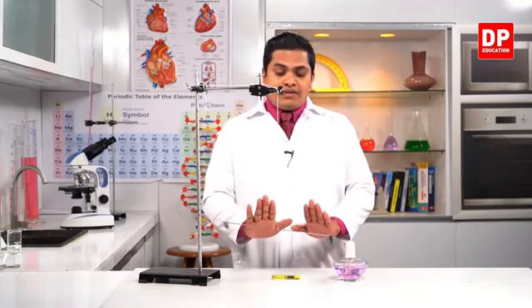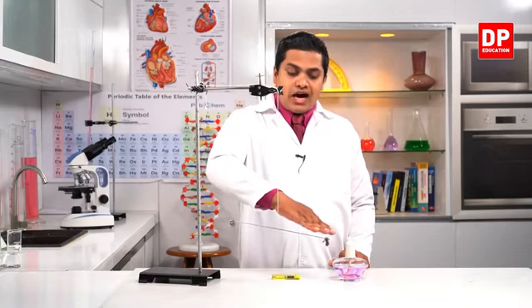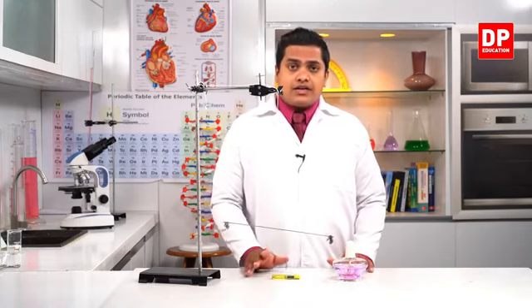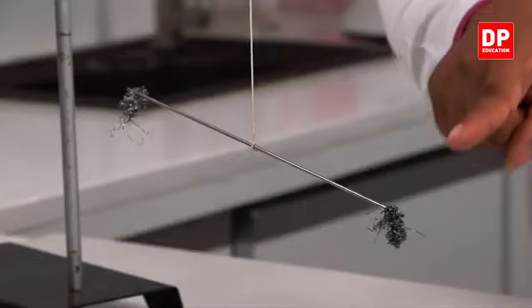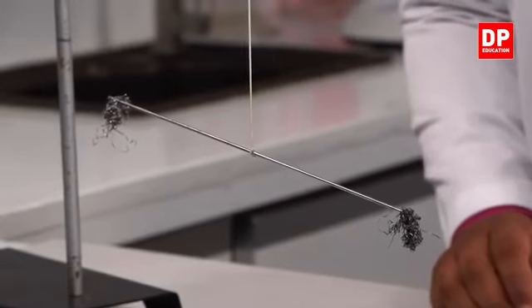And if you check the balance of this one, now you can see it's somewhat slanted to the other side. Not that much, but it has somewhat slanted to the end which has got burned. So in this case, we can say that after the burning, the mass of this iron wool has increased.